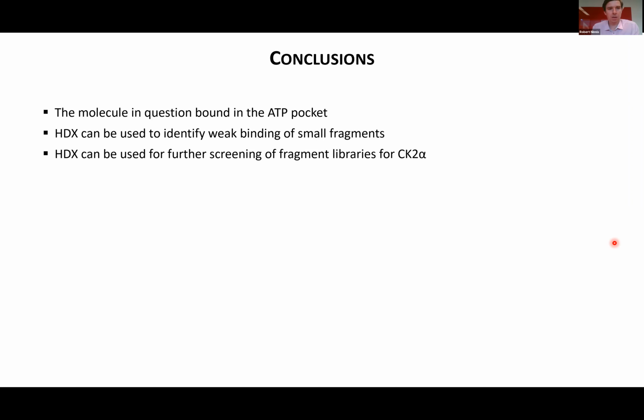Perhaps to start with, Sheena, maybe I'll ask you to comment on the applications of high throughput screening with this method. Yes, so I have not used the HDX for high throughput screening, but plenty of others have. I think one of the things that's really common is you screen groups of molecules at a time. And then you can focus on the peptides, like if you have a specific pocket you want to target. If you see a change, you can then take that group of molecules and do further screening with them. So I have not done that, but I know that others are definitely doing that right now.